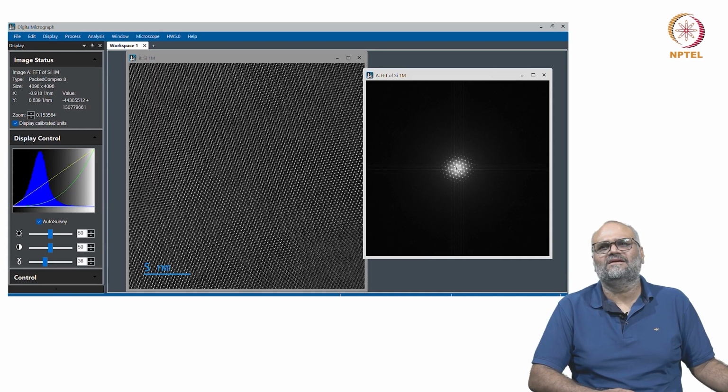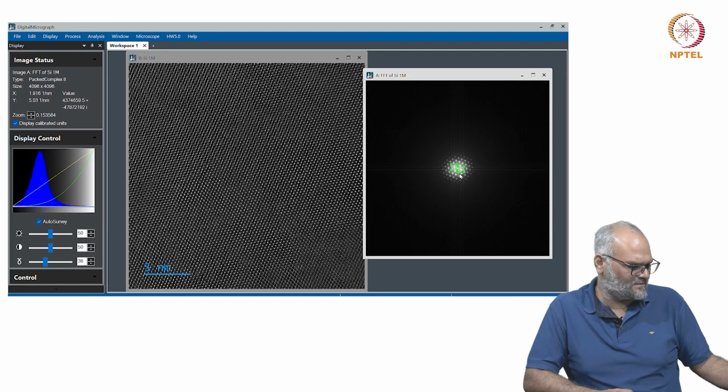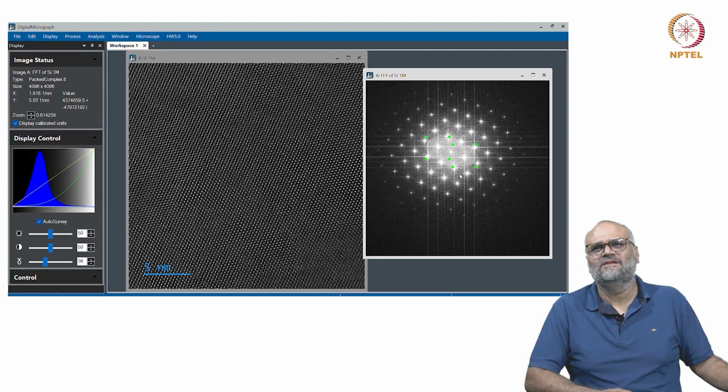if I click here, let me zoom in a little bit more so that it is visible.